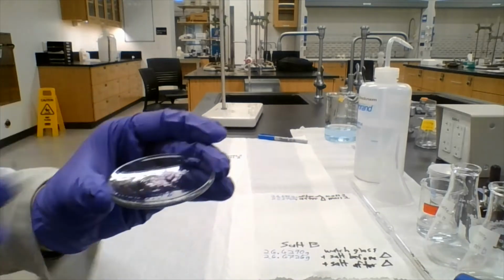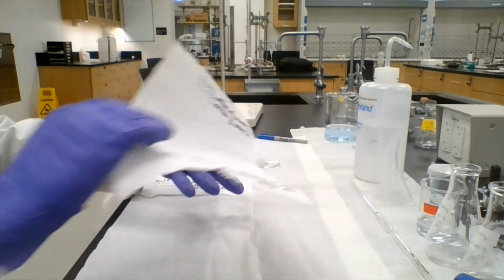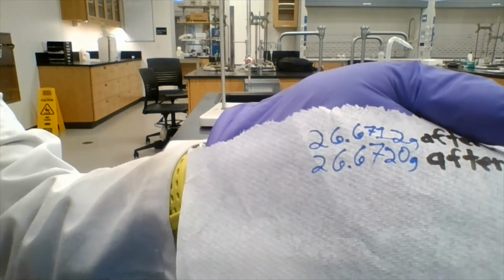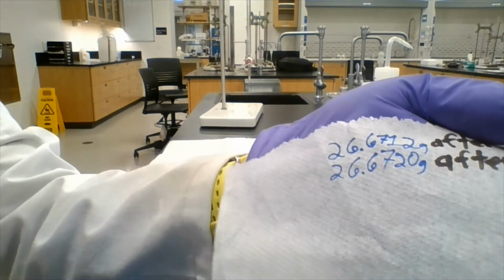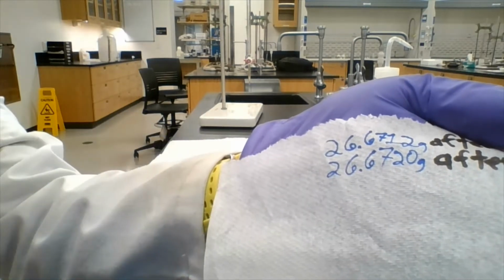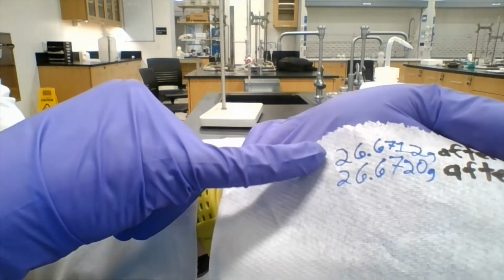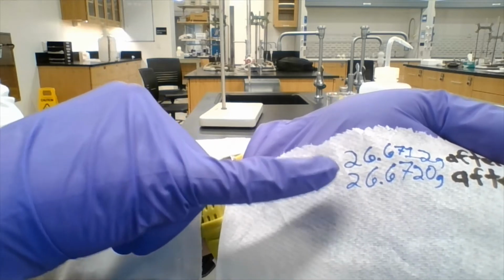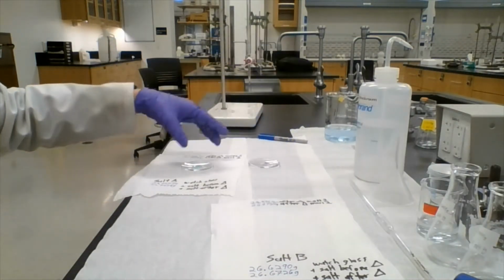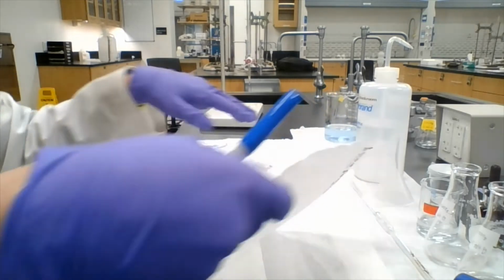With salt B, here's what it looks like, once again. And here are our two differences. Once again, the same comment. 1% of this would be 0.2671 grams, which again is more than the total mass of the salt that I added. Now, if I figure out how much salt mass I have here, this is within 3%. So once again, that is perfectly acceptable. So I'm going to just bring that down here.